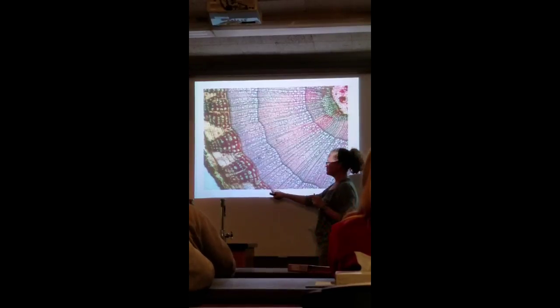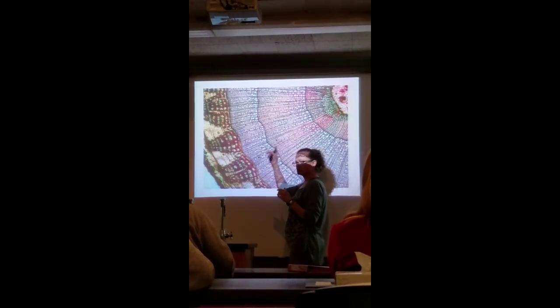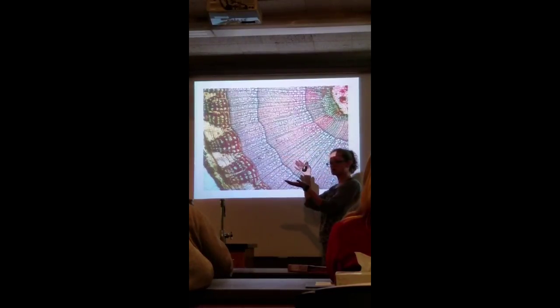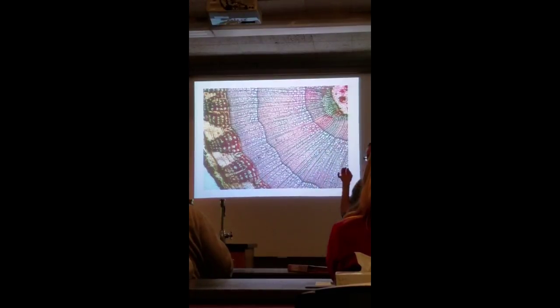That's the layer right here, right? Remember the vascular cambium is the layer that creates both of these tissues. So it divides and creates a cell towards the inside, which is xylem, and towards the outside, which is phloem. So separating the two. Speaking of that, the vascular cambium is what kind of meristem? Primary or secondary? Secondary. So it gives rise to growth in which direction? Width. Lateral, girth, width, I would take all of those. It's the same thing, right? It's getting wider. Any other questions on this?